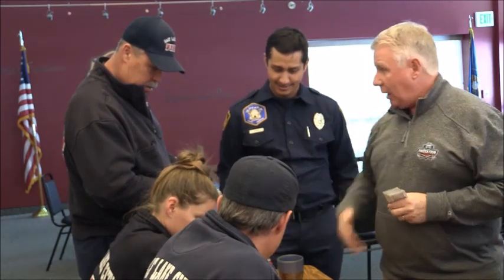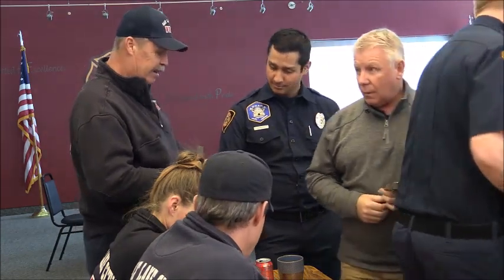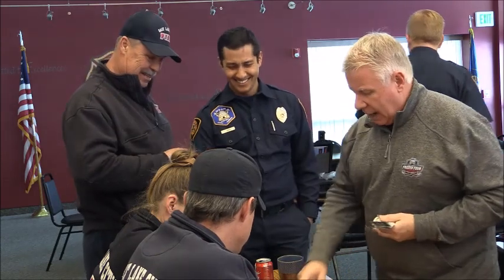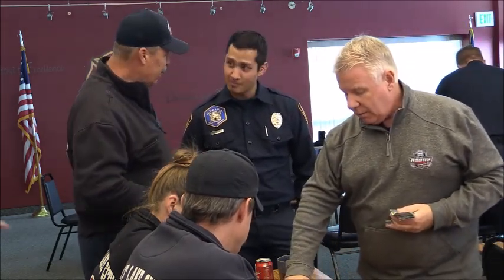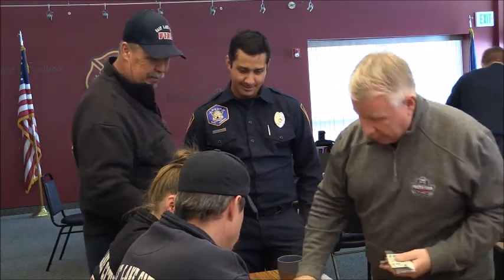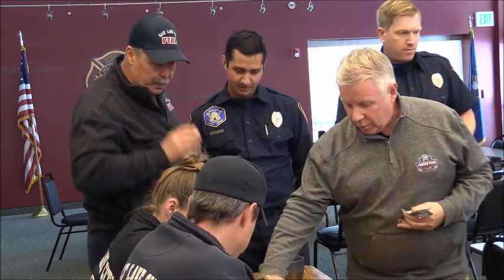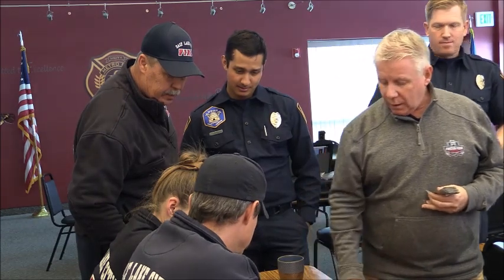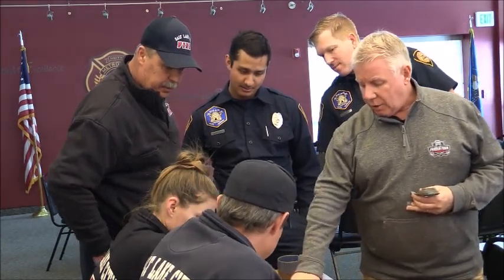It's going to give you a warning. Scan no materials to acknowledge it. You're ready to go. It's not scanning right now. You'll know it's scanning when this light is activated. Okay, so you can see here it's got self-test. The probe is in there. Go ahead and start. You can hit that or that at this point. That tells you the laser's on.